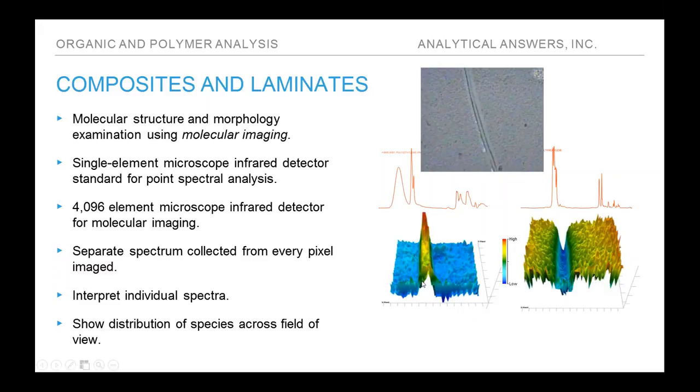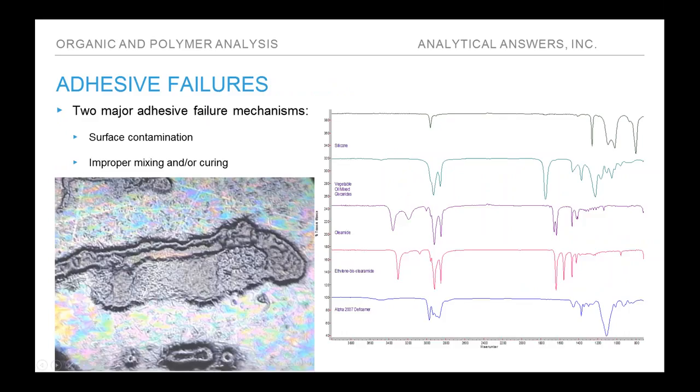The polyvinyl alcohol in this case was actually being used as an oxygen barrier in this packaging material. Polypropylene is a very good, very tough material, but it is somewhat oxygen porous, so a very thin layer, in this case just a little over 10 microns, of the polyvinyl alcohol serves to inhibit oxygen migration through the sample.